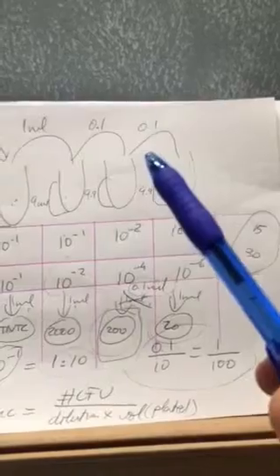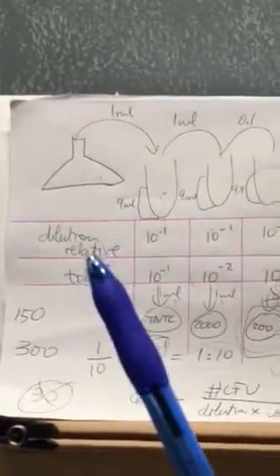You can plug it in your calculator to double check so you can see it for yourself if you like. And then same thing here. We're doing it again, 10 to the negative 2. Now make sure you keep those things separate. Relative dilution versus total dilution. 10 to the negative 1 for this first one. Negative 1 plus negative 1 is negative 2. Negative 2 plus negative 2 is negative 4. And negative 2 and negative 4 is negative 6.